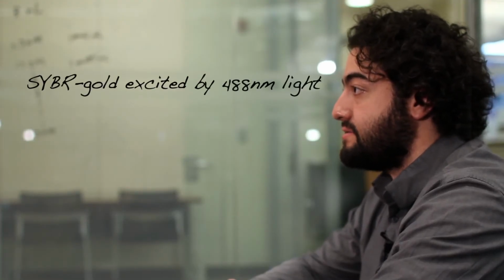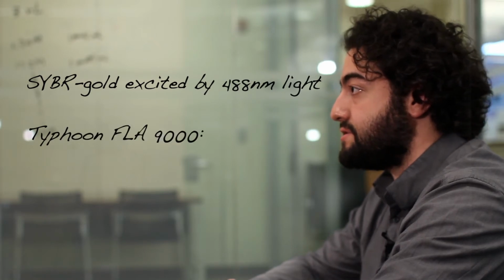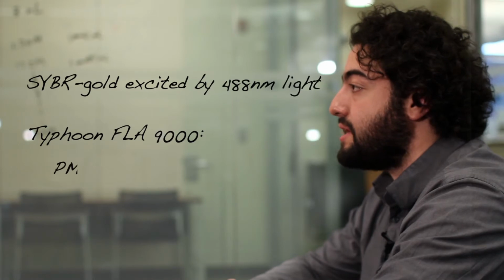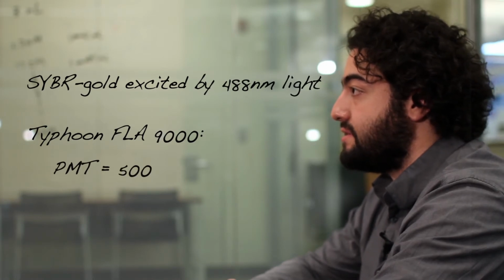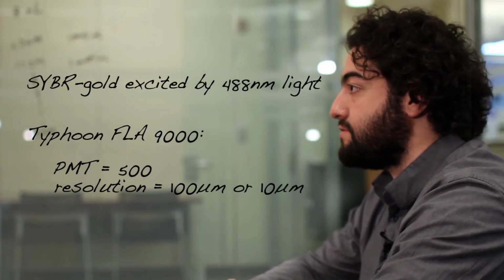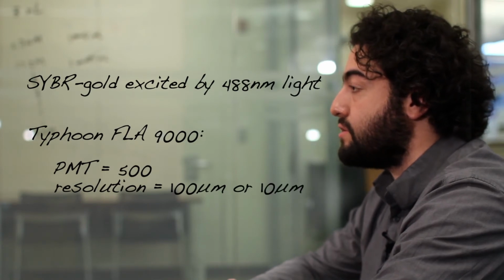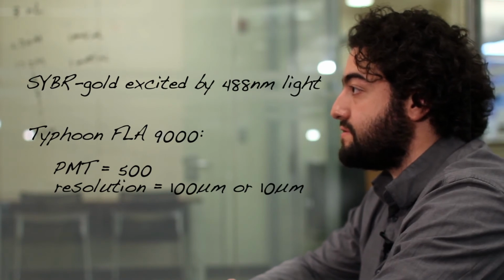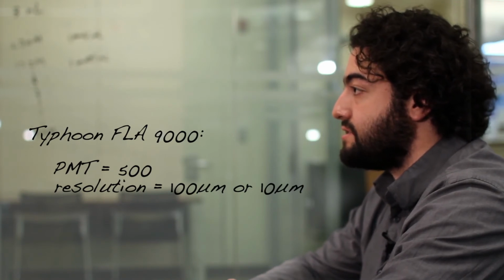SYBR-gold can be excited with 488 nanometer light. On the Typhoon FLA 9000, we usually image using the standard SYBR-gold settings with a PMT value of 500, and a resolution set to 100 microns, or 10 microns if we want to resolve two bands that are very close to one another. See our online methods and supplemental for details about image analysis, quantification, and kinetic modeling.